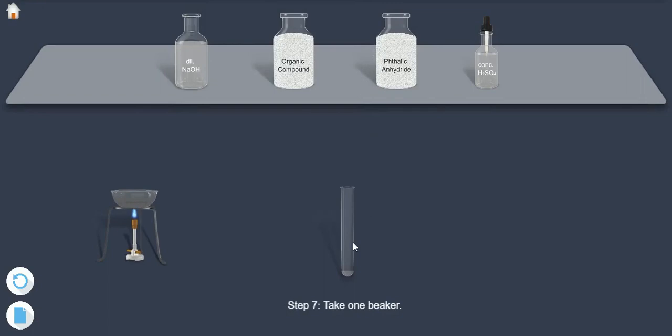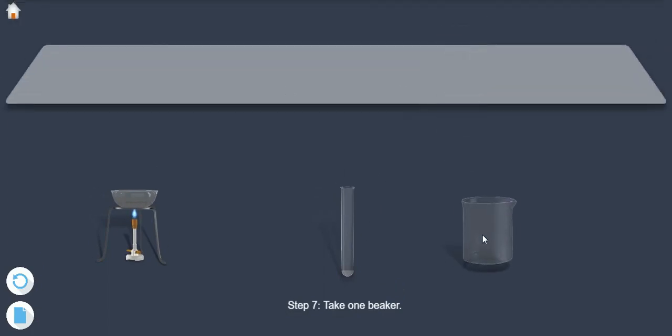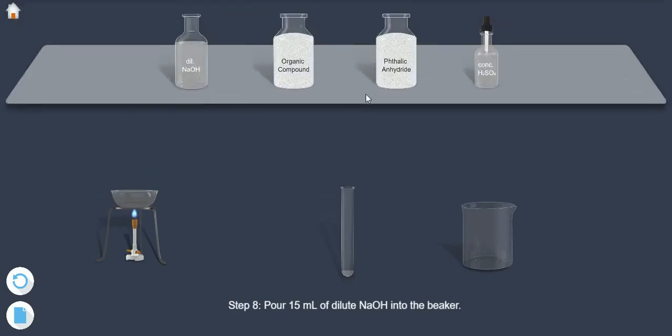Step 7: Take one beaker. Step 8: Pour 15 ml of dilute NaOH into the beaker.